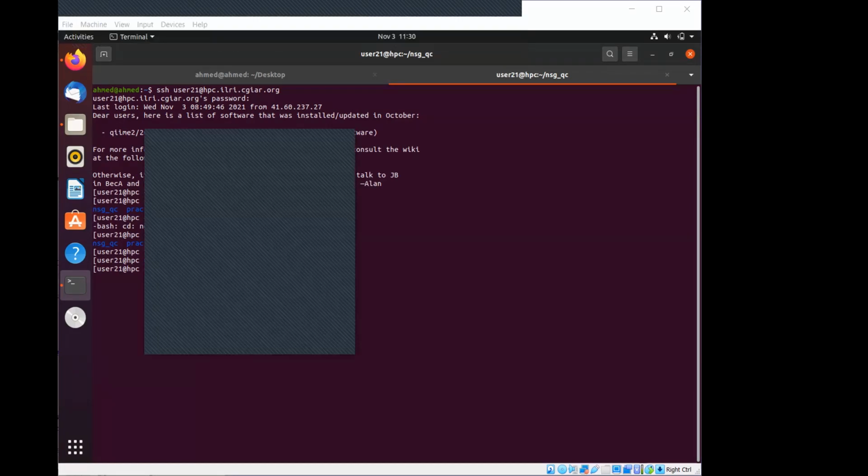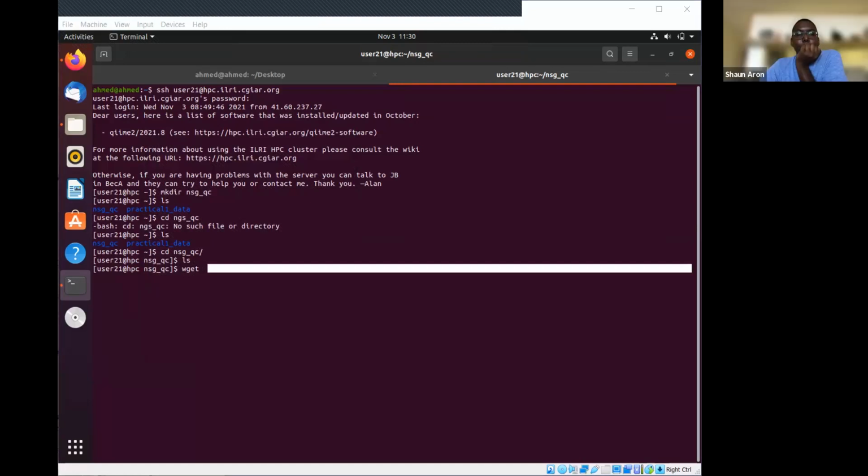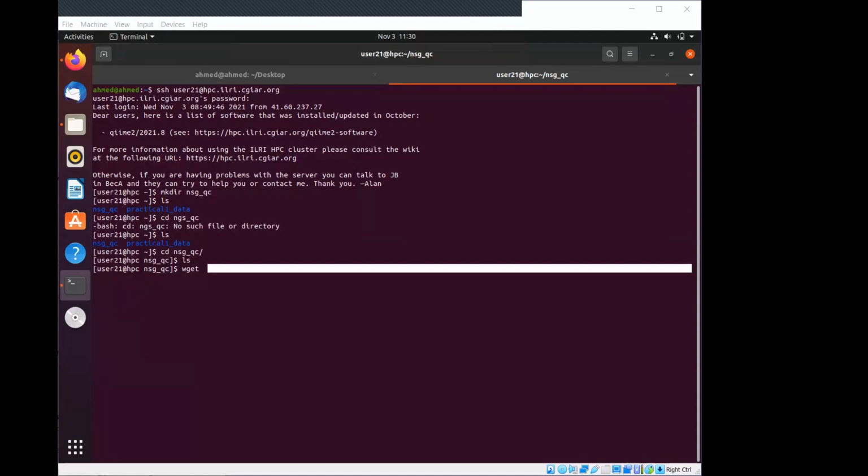Okay, so I copy this one. Yeah, so I'm here now.